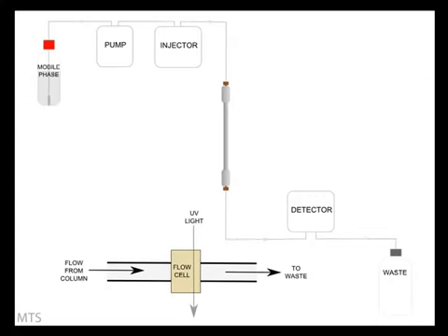Not all components absorb UV light, and those that do have different responses, so these factors need to be considered when choosing a suitable detector. There are a range of different detectors available which may be used for HPLC.